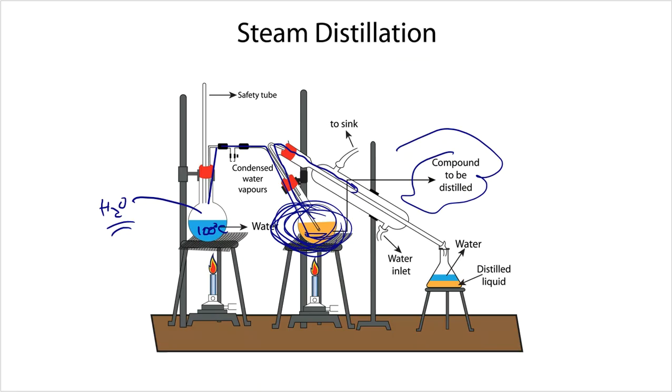Next up, we talked about steam distillation, and we said, listen, if we need to heat something up and we need some hotter temperatures, we don't necessarily have to heat that solution up directly. We can use something else to heat up that can get a little bit hotter. And that hotter stuff, aka steam, in this type of example, can venture off into the area that our sample is in, and that super hot steam can actually do some of the separation, evaporation, condensation steps for us in the distillation method. So this was kind of a quick review of the different versions of distillation that we talked about.